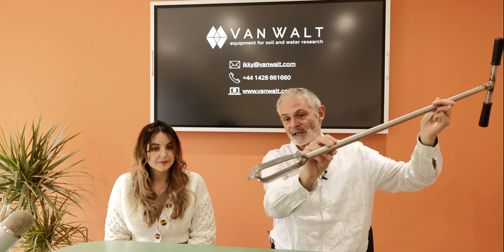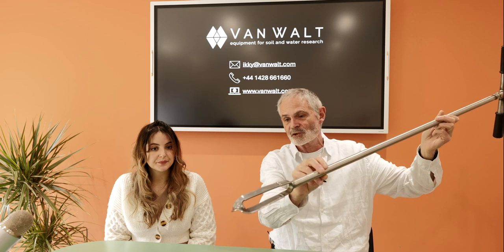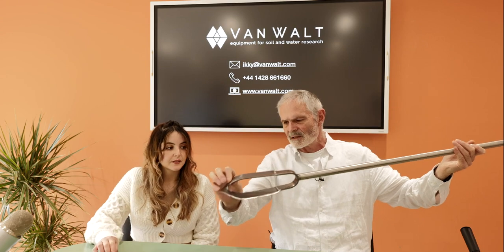So finally, on the hand augers, we've shown you they come in two parts, but they're actually also available in one length systems. In this case, a 50 millimeter Dutch auger, and in this case here in 75 mil. Total length, Vicky? 1.2 metres.